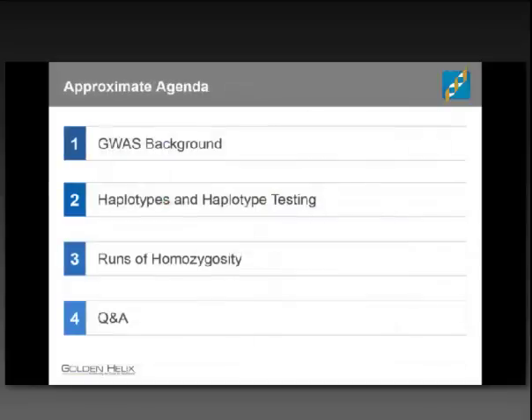As we go along, we'll start out with a basic overview of GWAS and various aspects of genome-wide association studies. From there, we'll move into a discussion of haplotypes and haplotype analysis options, followed by a discussion of ROH — runs of homozygosity — what that is and what you are able to do in SVS in relation to ROH features.